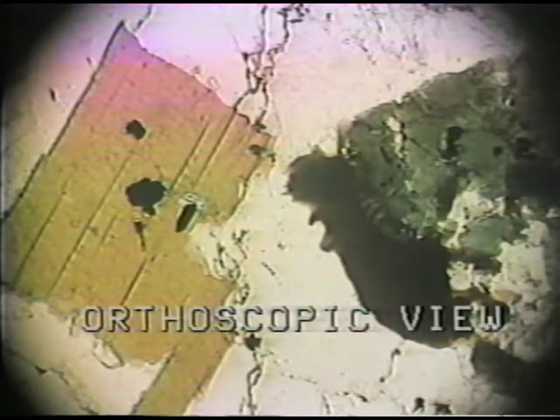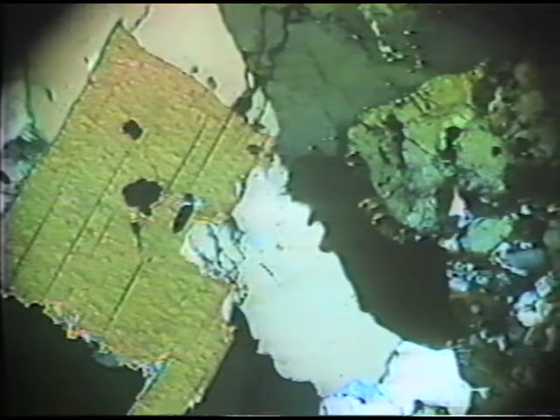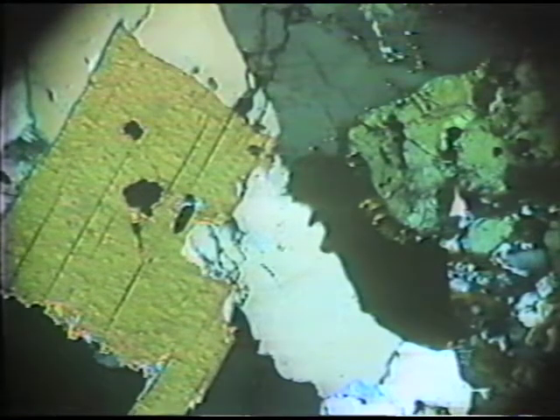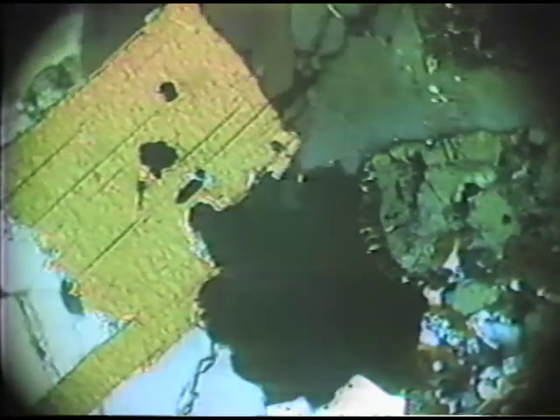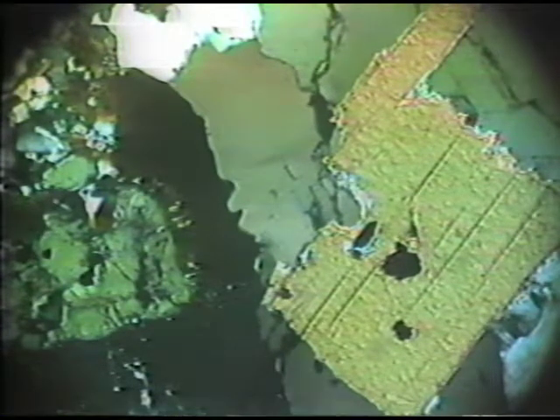Now watch what happens to the field of view when I put in the upper polarizing screen. Now the specimen is viewed in cross-polarized light. You can see that the overall level of light is much less, but the minerals are still illuminated, and we can test different kinds of optical properties in cross-polarized light.